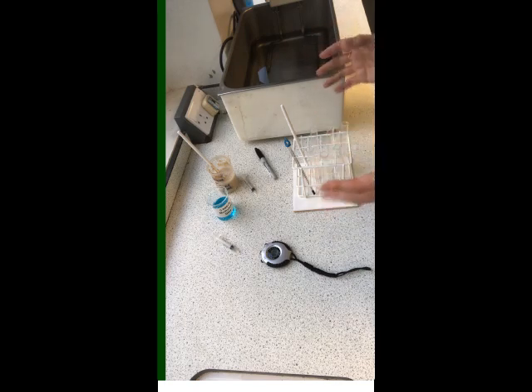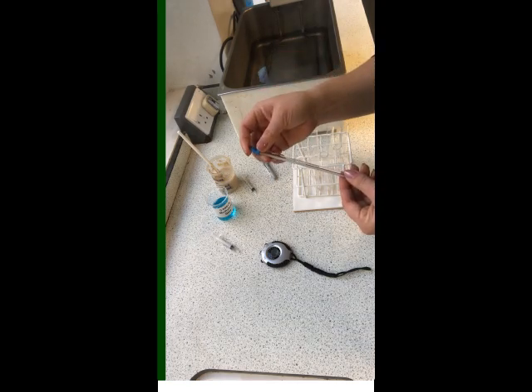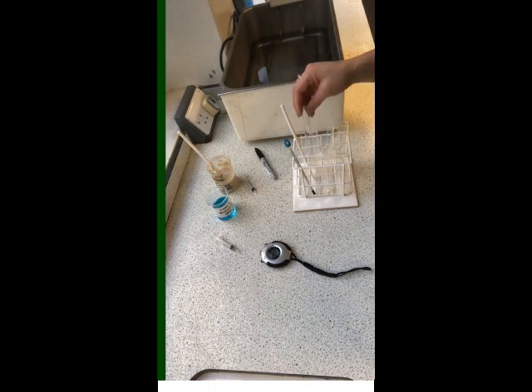And then for the other temperature, we're going to investigate room temperature. So at the moment, it has just snowed. It is roughly 23 degrees in the lab. So that's going to be our other temperature. So I'm going to run you through the method. Follow along with me, and we will hopefully pick up upon some key points in this.